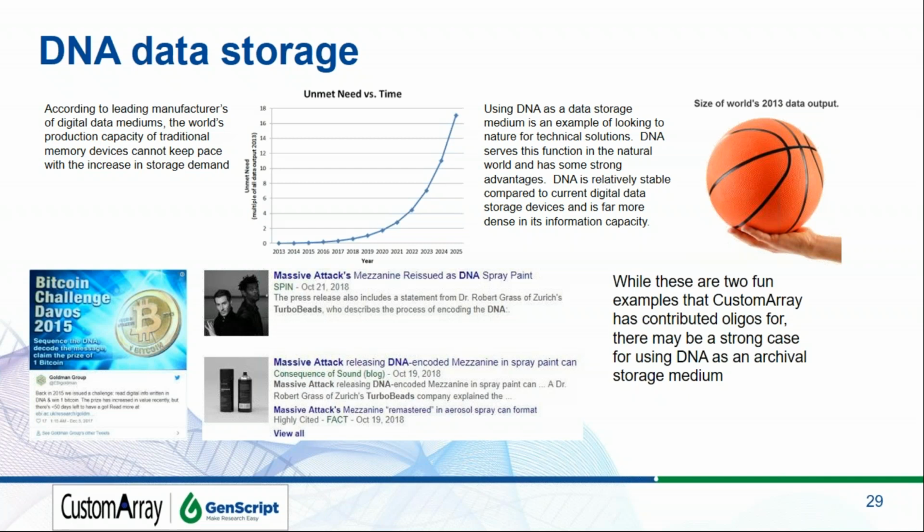that you could order as a collector's edition of the album. Now, this might be a little bit frivolous, but there is a strong argument that DNA could be used as an archival storage medium. There are all kinds of things that need to be archived for a very long time that are not generally ever looked at. The read and write time of DNA is not very good compared to flash drives. But from an archival perspective, something that you need to keep for a very long time, where there's a lot of data, it could have a utility there. And it's a lot of fun to work on.